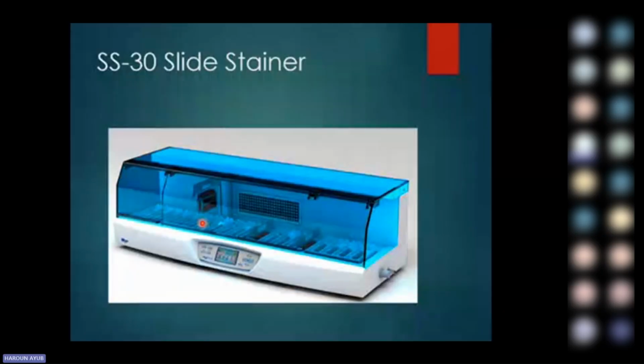So if you have here slide 1 containing another process, 2 another process, you can still load up to 5. So you can have different tissues undergoing 2 different programs. So you can have program 1 for H&E, you can have program 2 for Papanicolaou, and it will be able to process it automatically.